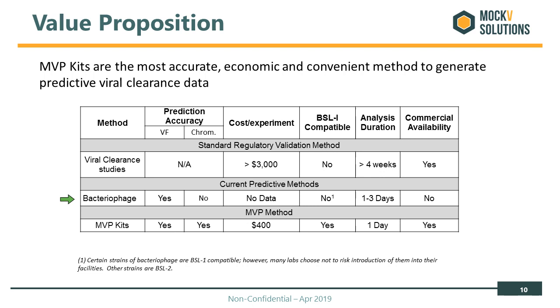In terms of surrogates, bacteriophage have been used for over a decade. They do a great job at mimicking the size and physical properties of these mammalian viruses, but they're really not meant at all to mimic the surface properties, and we'll be going into some detail on that later. Also, they're not as readily available. Your lab would have to be pretty proficient at propagating bacteriophage and quantifying the amount in solution.